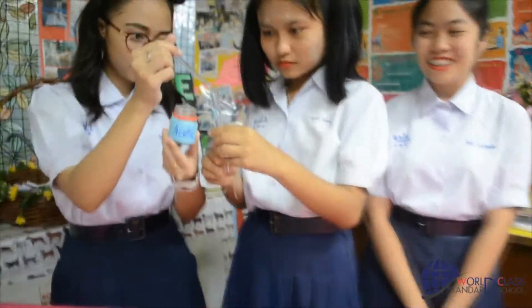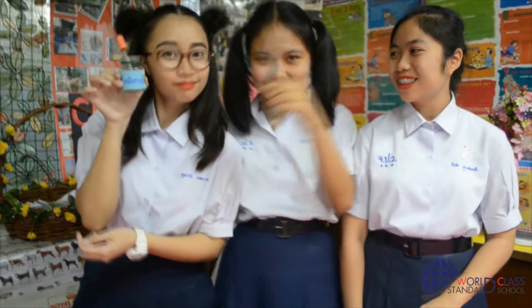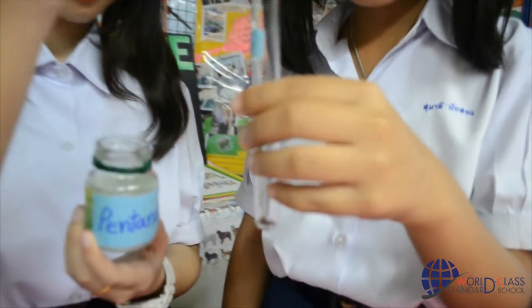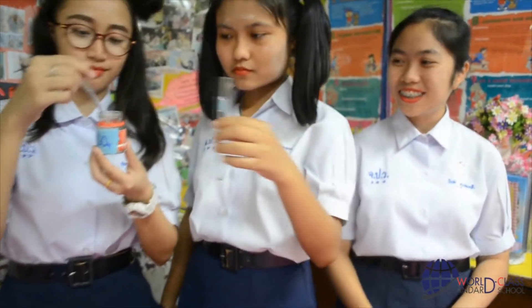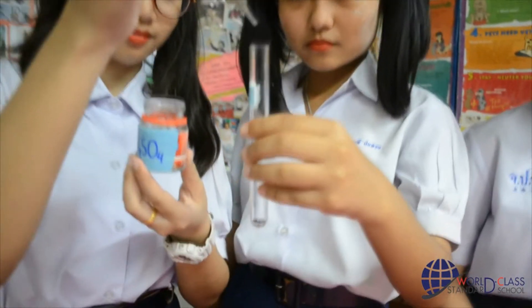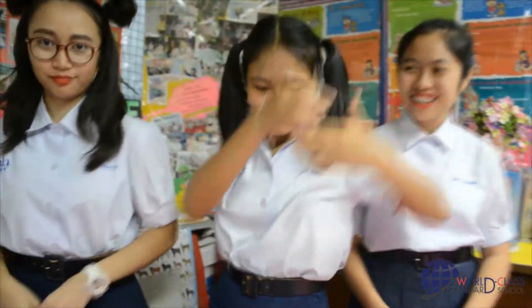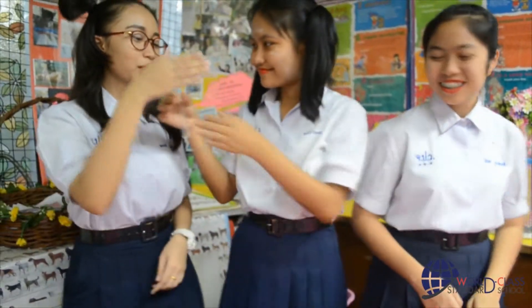Add 3 drops of acetic acid into a test tube. Then add 3 drops of pentanol into a test tube. Add concentrated sulfuric acid of one drop and mix together. Swirl the liquid loosely, then uncork.